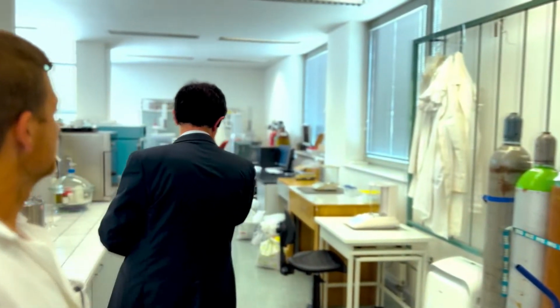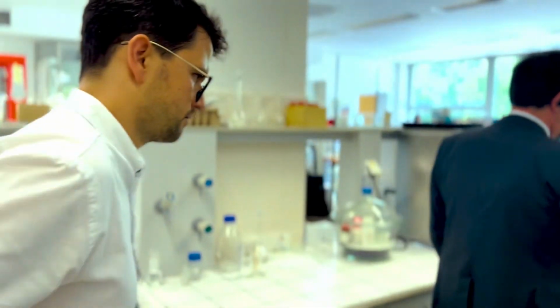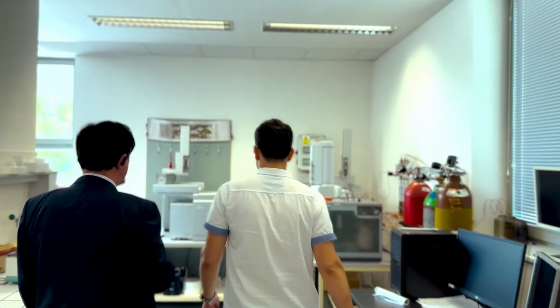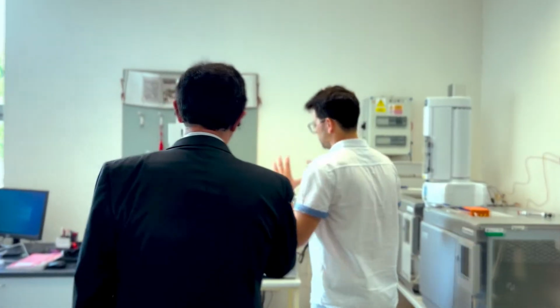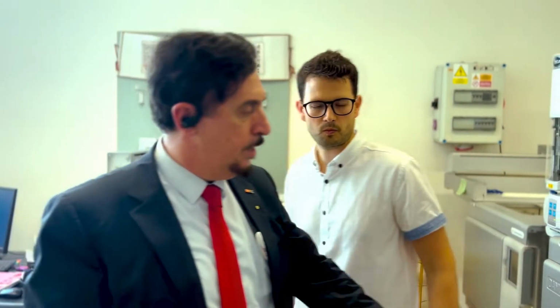And then what else? Here it is nitrogen content. What else do you measure? You mentioned chemistry, physical properties. We don't measure it here, but our partners, of course, measure performance of the fertilizer on plants, because the project is aimed at maize. They follow their growth in the greenhouse, but also in field conditions, which means that we had to prepare larger samples for field tests. But the machines here are measuring what?